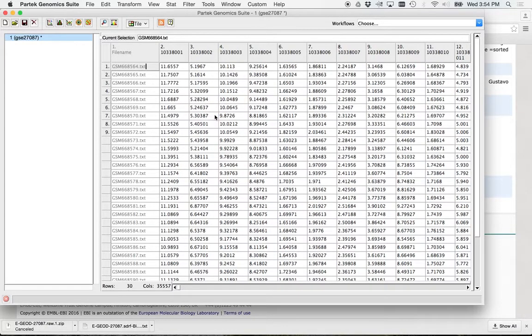Bam. I'm going to tell you right now, you've officially got your warning: there is no backspace in Partek. None. Just to warn you. I've been stuck on Excel, so one time I hit backspace like 14 times just to get to where I needed because I messed up. I recovered it, but when you mess up here, it stays. So no backspace.